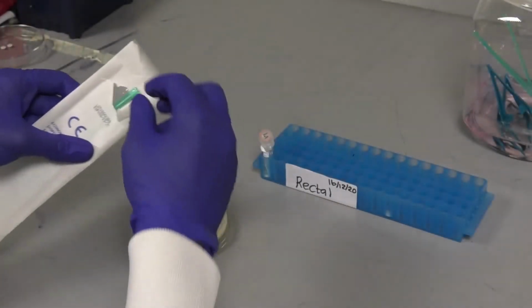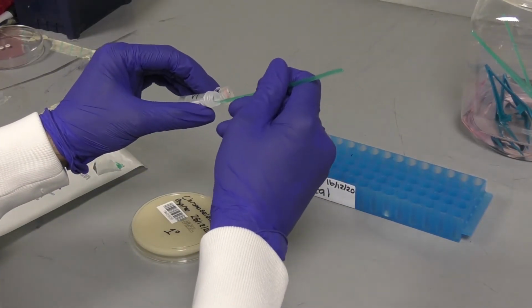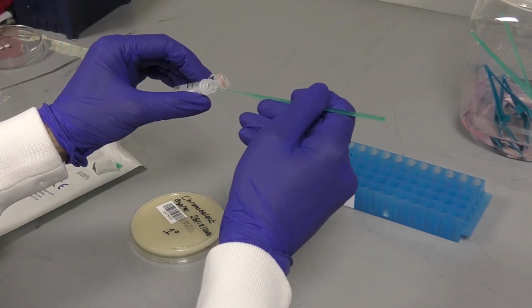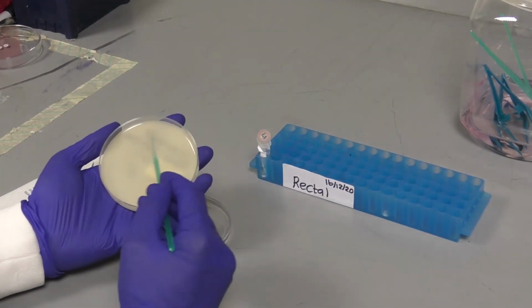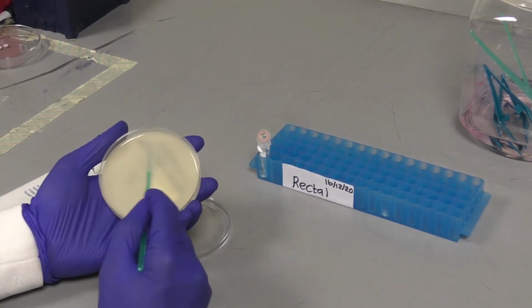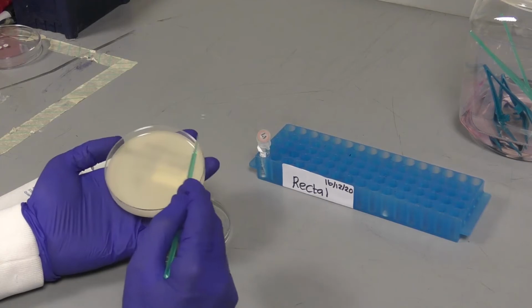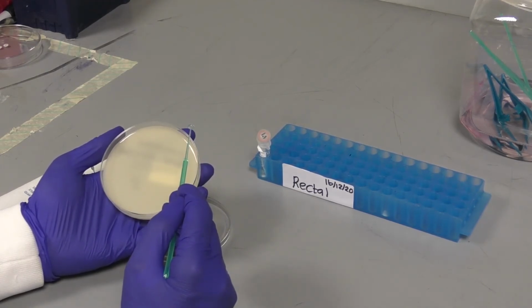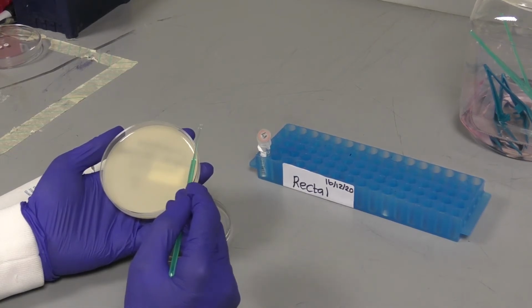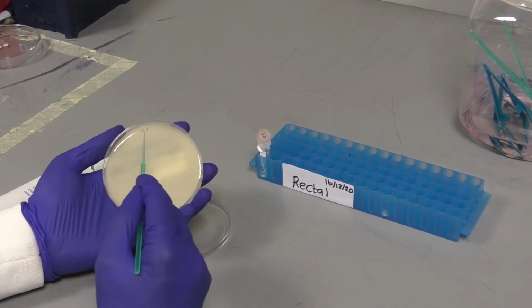Change loops between each 10 microlitre inoculation or flame the metal loop in between. Then go on to use the quadrant streak method to complete the inoculation process. Once you've inoculated your 20 microlitres, you will rotate the plate 90 degrees and then streak using a flamed loop or a new side of a disposable loop.